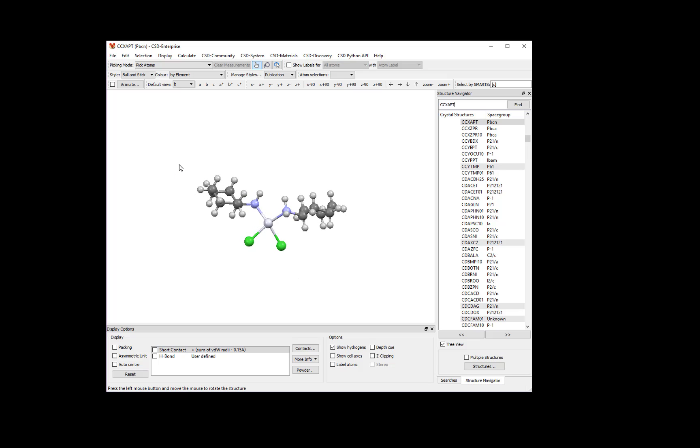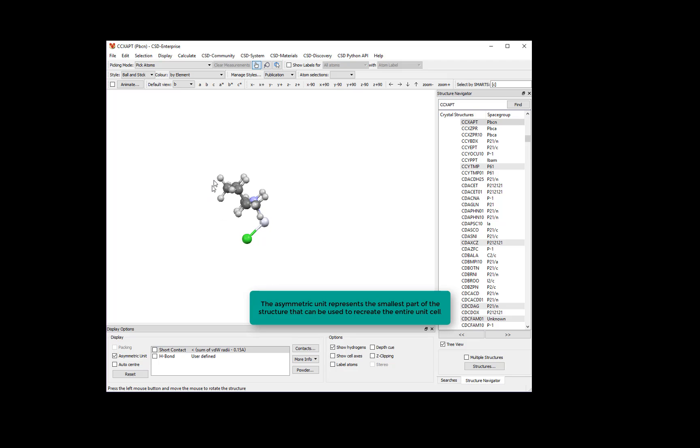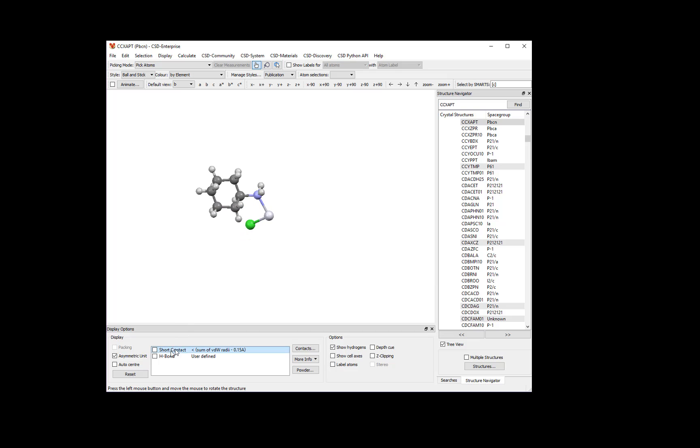In fact, only one half of this molecule is crystallographically unique. To understand what I mean, tick the box next to asymmetric unit in the lower left of the Mercury window. Now you can see that half of the molecule has disappeared. The atoms shown now are the crystallographically unique part of the crystal structure. Untick the box to view the whole molecule again.